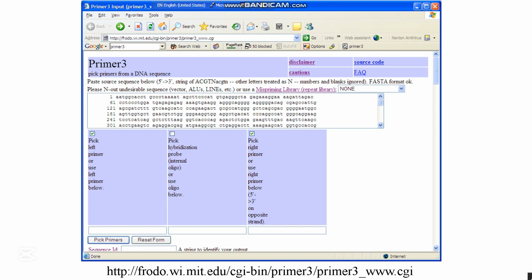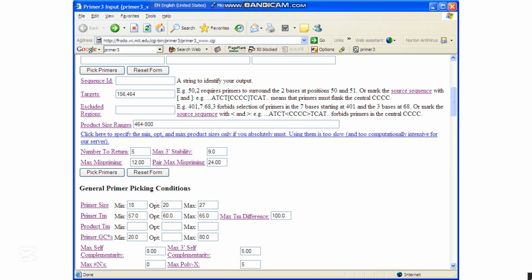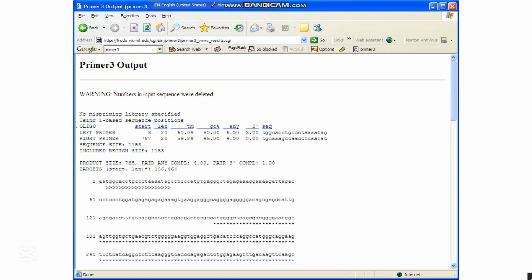And then open Primer3 and paste it into that box. Just check this one, left primer, the forward primer, and the right primer, the reverse primer. Don't check this, and just click on pick primers. There is also information such as sequence ID, the number to return, the primer size, the primer TM, the product TM. Okay, done, and we got the primers.